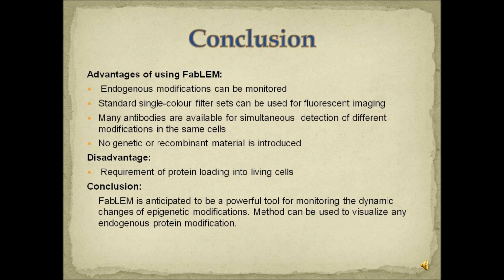3. Many antibodies are available for simultaneous detection of different modifications in the same cell. And 4. No genetic or recombinant material is introduced, therefore imaged cells and embryos can act as donors for reproduction studies. FabLEM also has the following disadvantage. 1. The requirement of protein loading into the living cells by use of microinjection is monotonous, and other methods are not as standard as DNA-mediated expression systems.